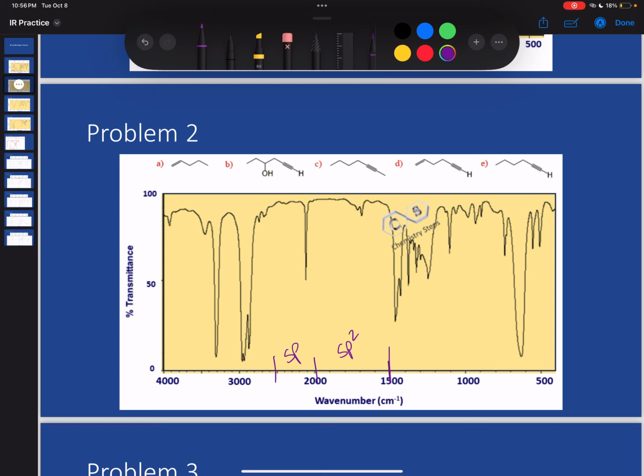All right, so I know a lot of you guys have been emailing me, asking me, how do I know if a peak is significant? Okay, we just kind of get a feel for it. I know you guys don't like that answer, but it's really just a practice thing. So some of you guys might be jumping at this and like, oh, it's a peak. I'm very hesitant to believe that that would be a peak. I would be very suspicious of that one. But that's not where my eye's going to jump to.